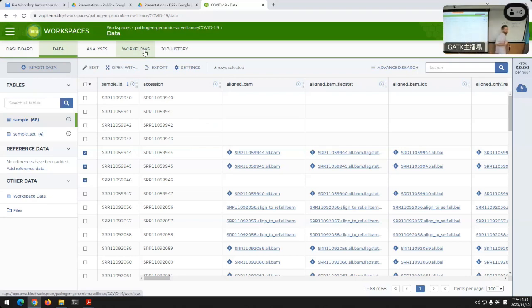And then in that table, you would be able to select the row for that cohort that you created. And then you can pick and choose which cohorts to run your workflows against in a very efficient, user-friendly manner, right? You don't have to constantly remember, which files do I want to organize and how are they organized on my machine? Terra tries to take care of all of that for you.